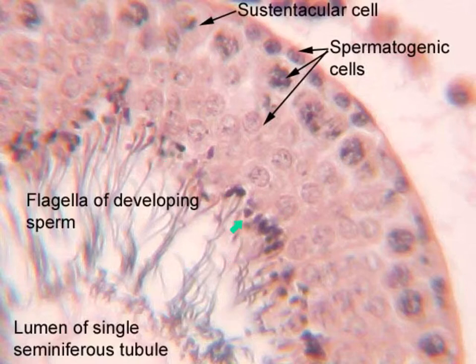And then we have the spermatozoa, and these are what we think of when we think of sperm, with the flagella. And there are other stages. There's the primary spermatocyte, and there are the Sertoli cells, etc. However, we will just identify the spermatogonium, the spermatids, and the spermatozoa.